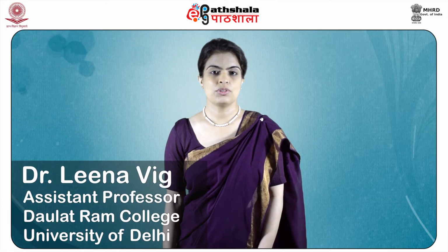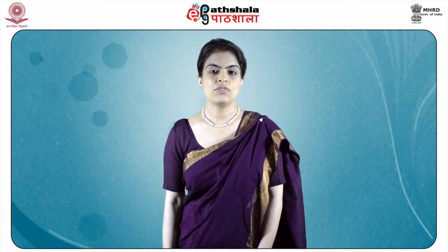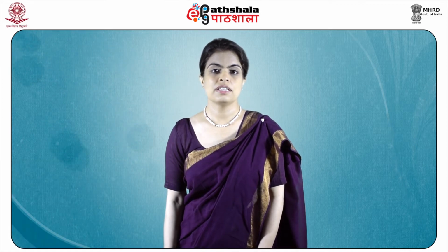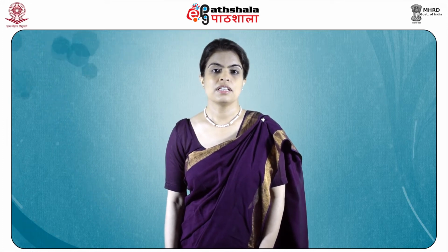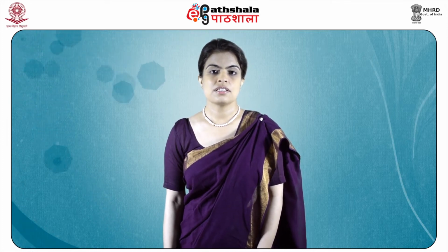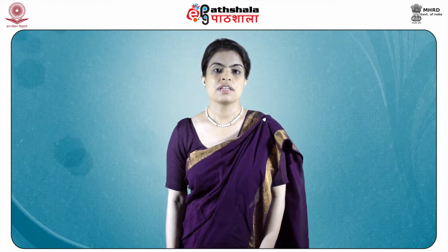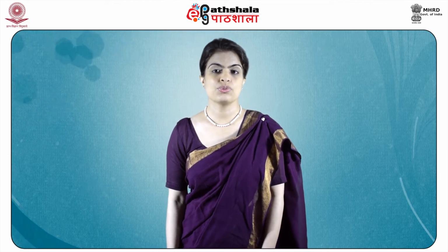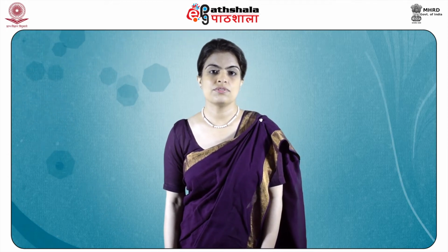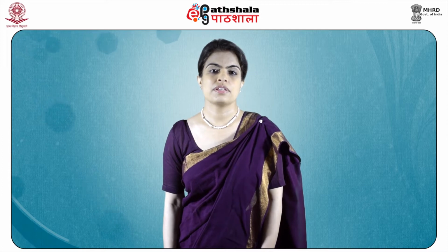After studying this module, you shall be able to know the principle of ion exchange chromatography, learn the two different kinds of ion exchange chromatography, learn the considerations behind choosing an ion exchanger for an experiment, identify what kind of ion exchanger and pH conditions to use for separating a protein from a mixture, and lastly, how to analyze the results obtained from an ion exchange chromatography experiment.